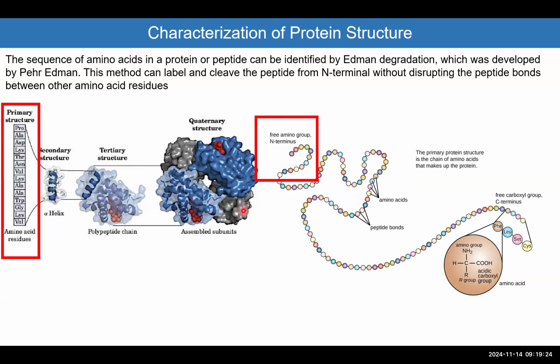Now, back in the time when people were starting to find ways to sequence biomolecules like DNA or RNA, they also thought about sequencing proteins. I'm not going into the details of this because it's very rarely used unless you are a specialized biochemistry lab that performs sequencing for proteins.